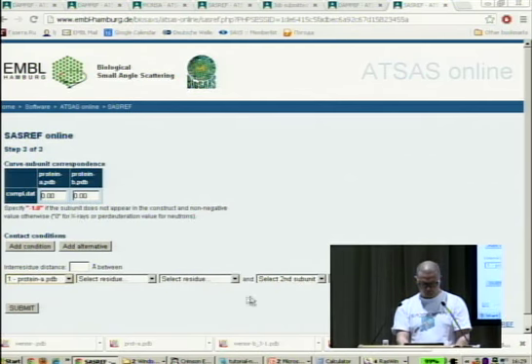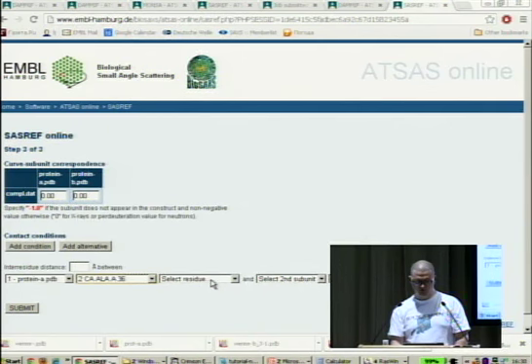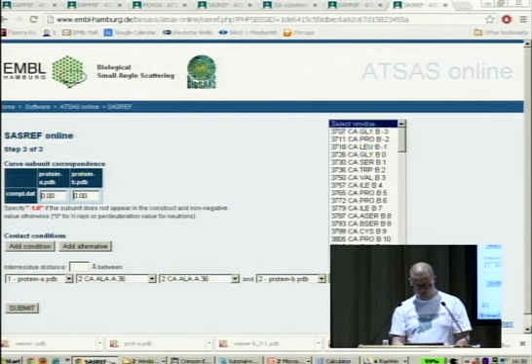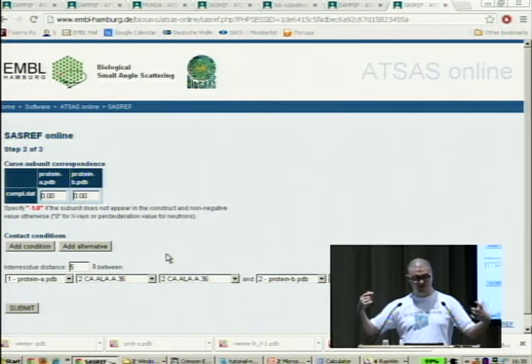So here we have two subunits, and if we select just here that the first subunit, first residue should contact with the first residue and give some distance in angstroms, that would mean that really the program will measure the distance from residue to residue.